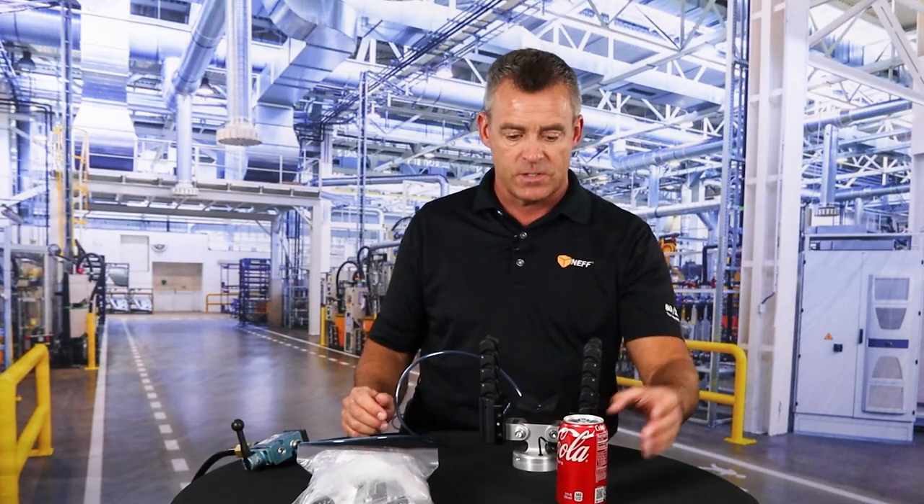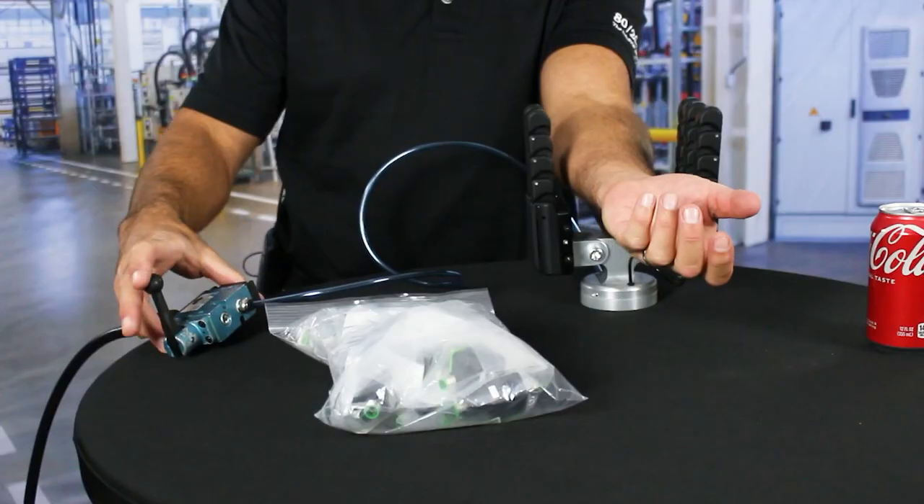And then finally, to demonstrate the collaborative nature, I'll put my own arm inside. Doesn't hurt.